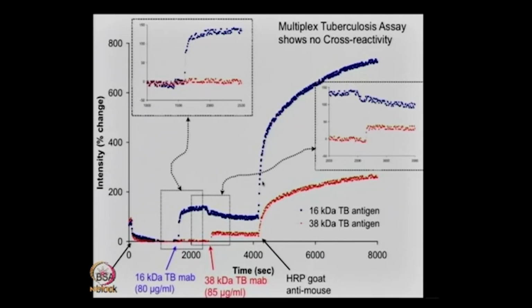If we see the signal of both, then I think we know that person is actually positive. Well, TB is a very hard thing to detect, but at least now you know that you have two signs it's there. And you can imagine adding other types of potential markers for TB, and so you get more and more sure that something is happening. It's more of a proof of concept, which you're showing, but I think it can be applicable depending on the context. Yes, one can make the assay more robust with the introduction of the right type of proteins and more markers.